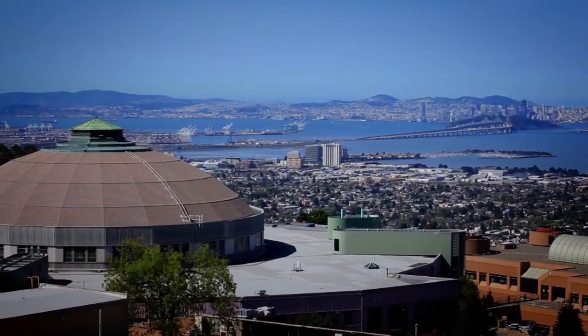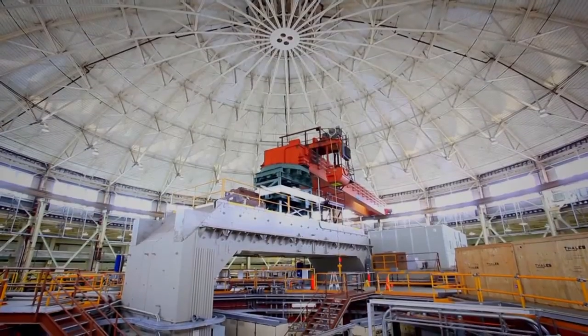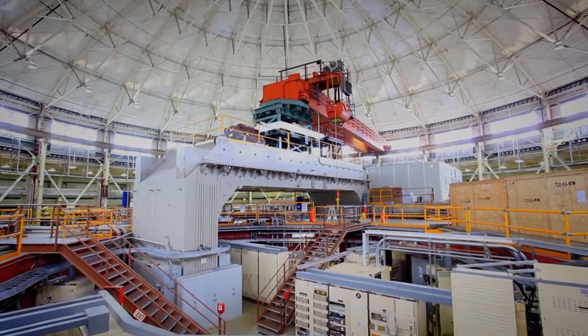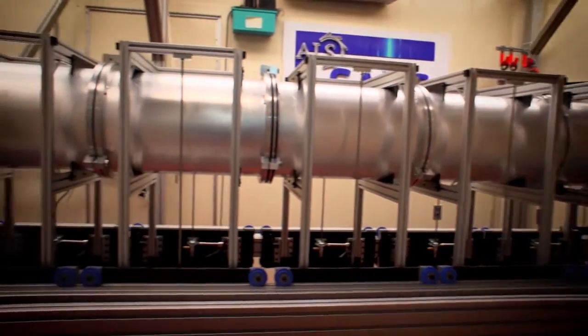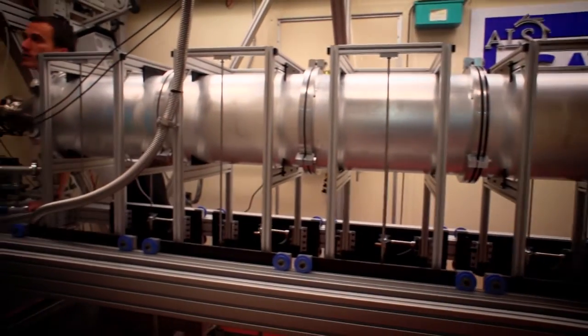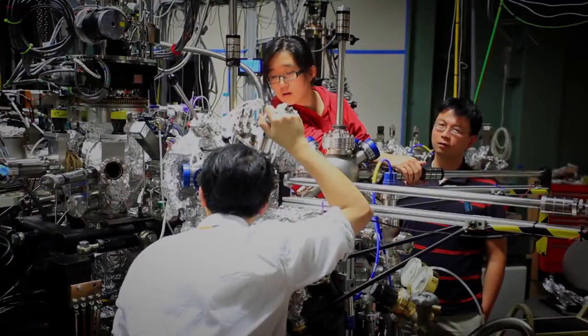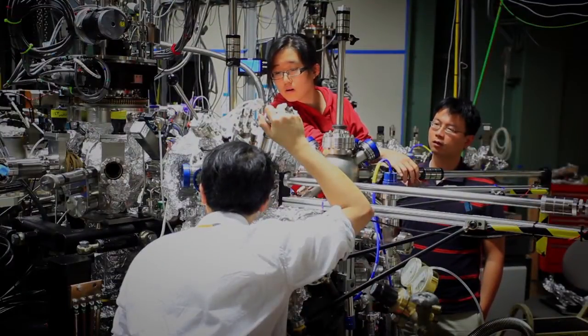First we go to the advanced light source and we look at them with the scanning transmission x-ray microscope. This microscope has a very high energy resolution and as a result of that we're able to see the lithium distribution in each particle at a specific state of charge of the battery.